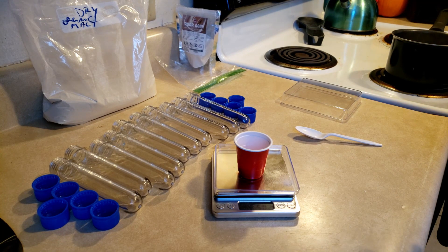Once those get done boiling, we'll empty that pot out, get our 100 milliliters of distilled water in there, and we will mix our powder into our water and get that made.